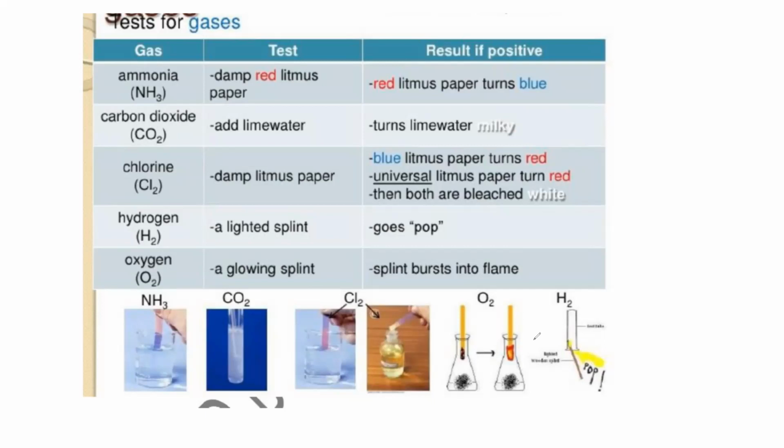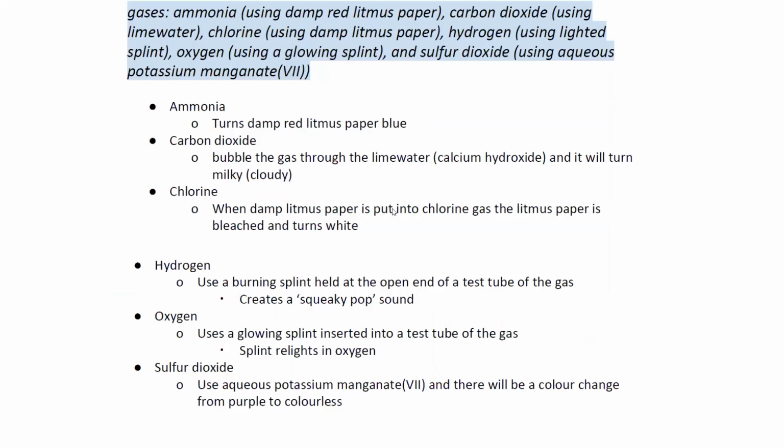And the last one, if oxygen is there, we add a glowing splint. What we observe is that it will relight or burst into flame. So you have to learn the tests for these gases as well. Now there's also a video recording related to the test for the gases. I will show it in a minute.